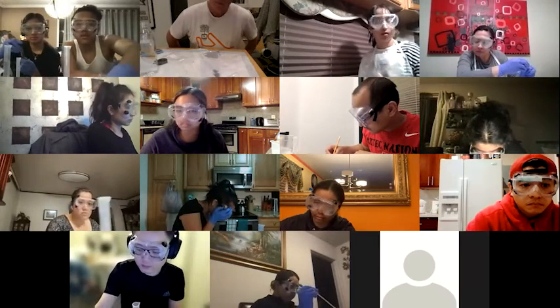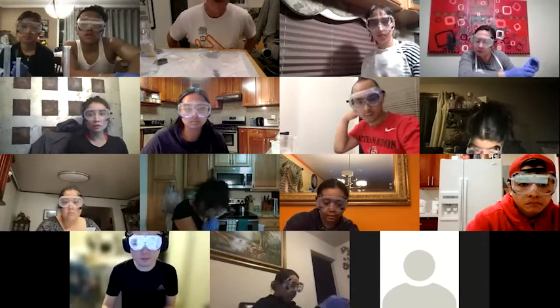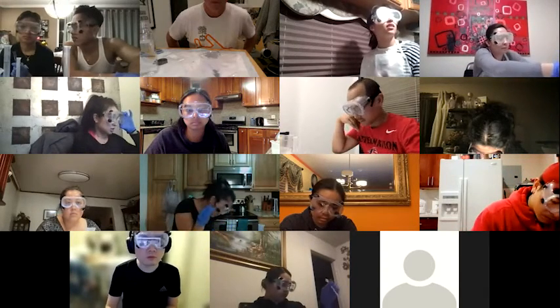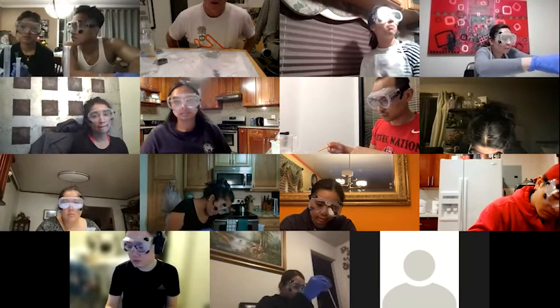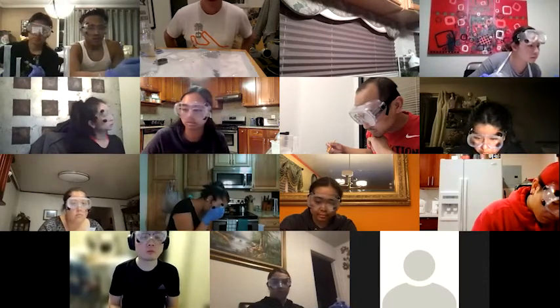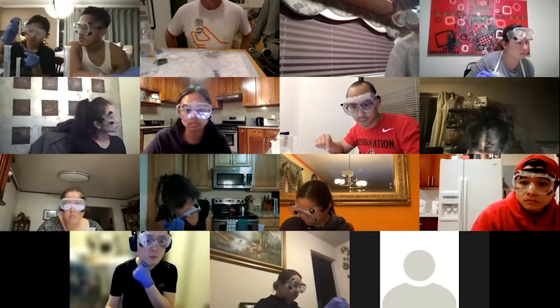So if I swapped out into the glass one, it's gonna cause too quick of a reaction, right? Sorry, what was the question? If I swap out, because I found a glass one, but I already filled it in the other one, it'll change the reaction too quickly, right? Is that what you were saying? Because you want to have that layer of the water on top. Oh, it'll still work. Yeah, just pour out the contents of the plastic tube into the glass one and then just go ahead.